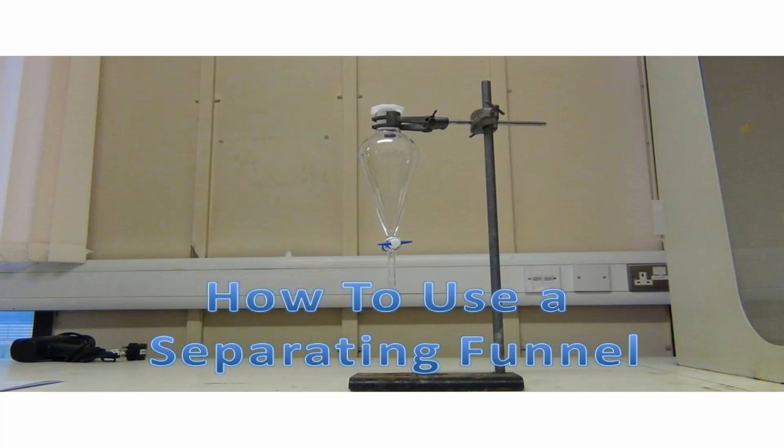Separating funnels are used for liquid-liquid extraction, also known as solvent extraction. They come in different shapes and volumes, but always ensure that you do not fill the separating funnel more than two-thirds full. Also make sure to clamp around the ground glass joint at the top of the separating funnel.